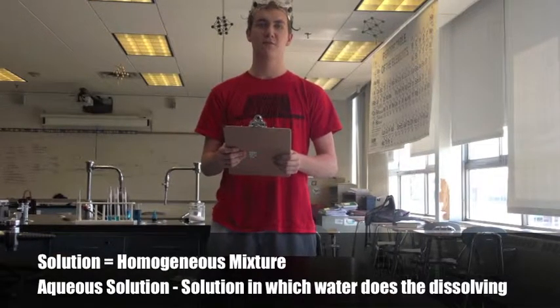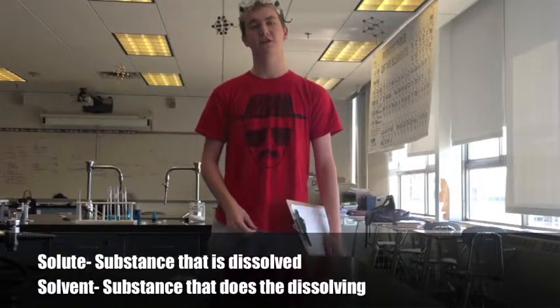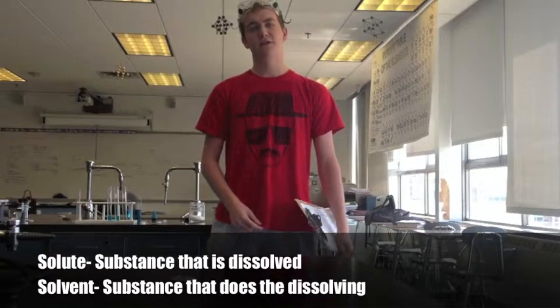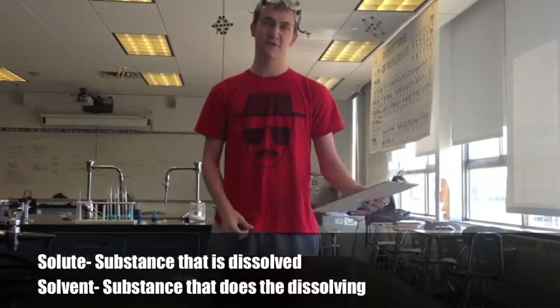In this experiment we will create a homogeneous mixture which will contain sodium acetate as our solute and water as our solvent. Now my business partner Gus will show you the different types of solutions.